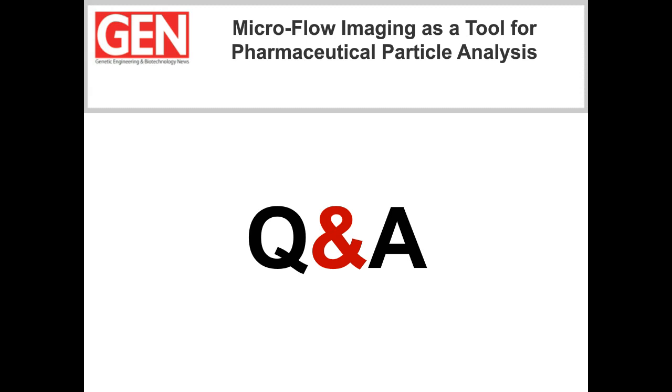Thanks, Miranda. Colin, we have one more question for you. One of our audience members would like to know, what is the MFI data size per sample? So for the samples that Miranda was analyzing, as she mentioned, they're samples that have a lot of particles in them. I would expect the size of those analysis files to be somewhere in the 200 to 300 megabyte range. So they're relatively large because of all the image files that MFI captures during its analysis.